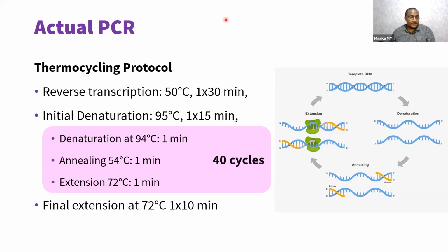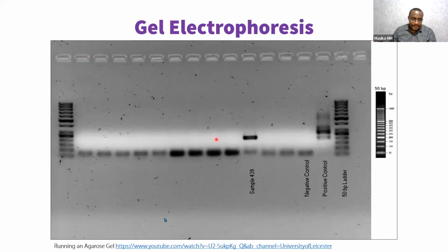Can you repeat the gel electrophoresis mechanism? Sure, we can. How do we identify presence of viral DNA? Okay. So what happens with the gel electrophoresis is that you have the sample from the PCR, the amplicon, and you mix it with two things.